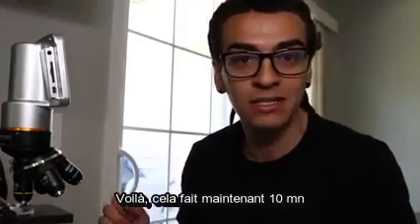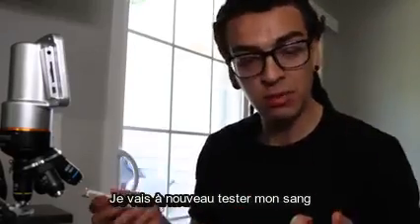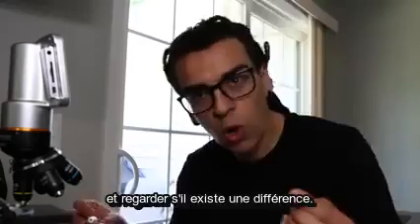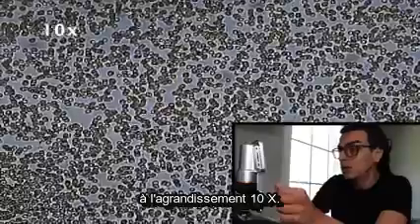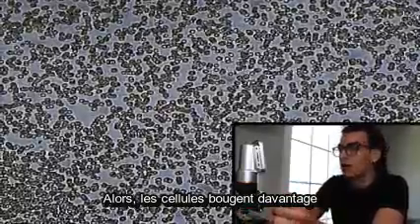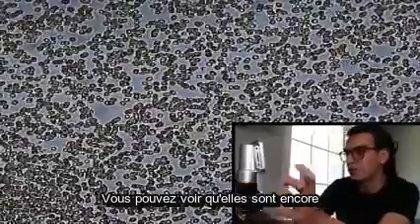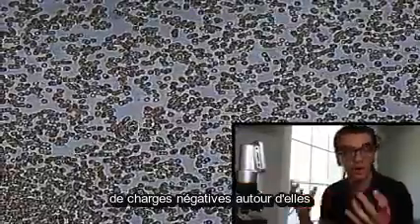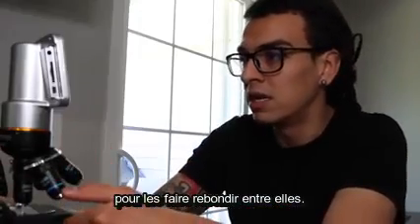All right, guys, so it's been 10 minutes since I drank a 12-ounce cup of coffee with almond creamer. So I'm gonna be testing my blood again and see if we can see any differences. All right, so right now we are looking at my blood at 10 times zoom. They are moving a lot more than they were, which is a good thing, right? But you can see that they're still getting stuck to each other, and that's because the blood cells are not surrounded with a negative charge to bounce off each other. So let's go to 20 times zoom.